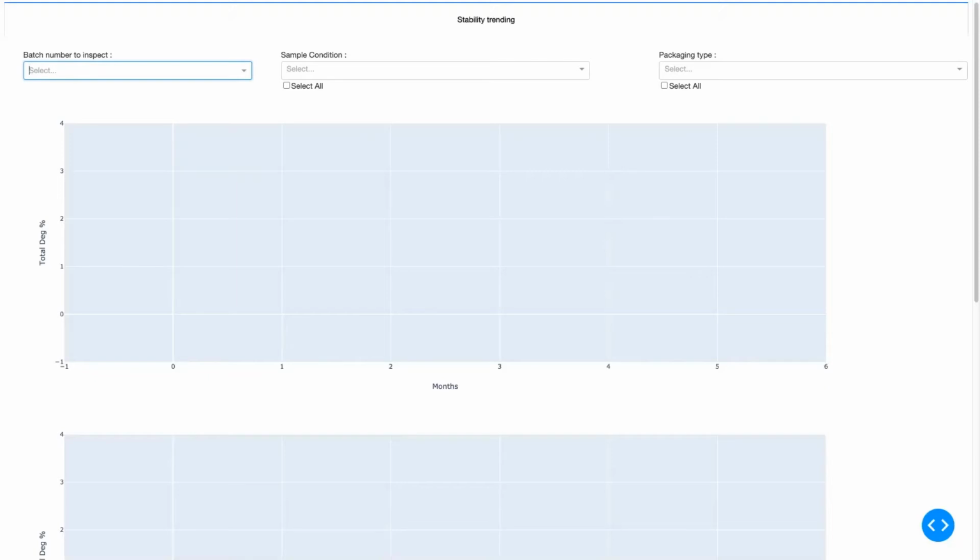So we have already ingested most of our LIMS system and constructed a semantic layer around it. Now I can pull the verified data through an SQL query, do a little bit of cleaning and data science magic, and now we have a dashboard, which is a web app, easily accessible to any associate. Now this way, the analytical project leader, any analytical project leader, can navigate the data and understand the behavior of the product she's developing. So let me show you here.